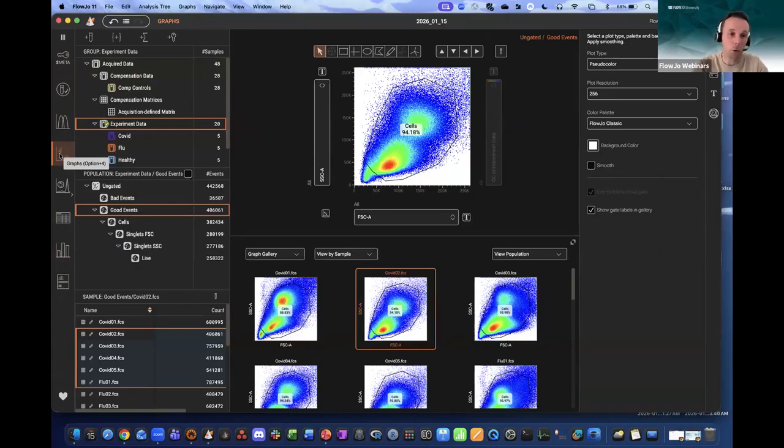You can do your compensation first and do the QC after. But when we designed the software, that's what we had in mind: put my sample into FlowJo, annotate it if needed, then go directly to QC before you do anything. But as I said, the QC is not applied on your compensation controls, so it doesn't really matter if you do your compensation before or after the QC.